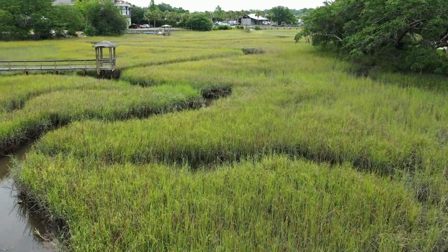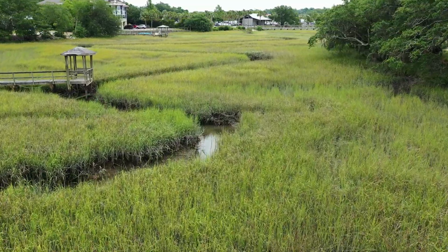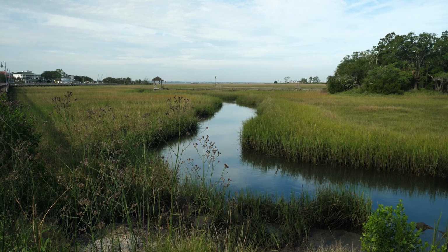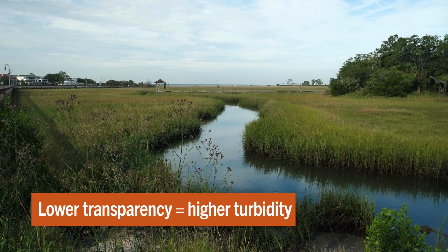You may have heard a different term called turbidity. Turbidity is a measurement that can be approximated from transparency. While transparency and clarity refer to the clearness of water, turbidity describes the murkiness or cloudiness of water. Turbidity is determined by measuring how suspended material, like soil, algae, or phytoplankton, affects light penetration in the water column. The more cloudy the water, the higher the turbidity.